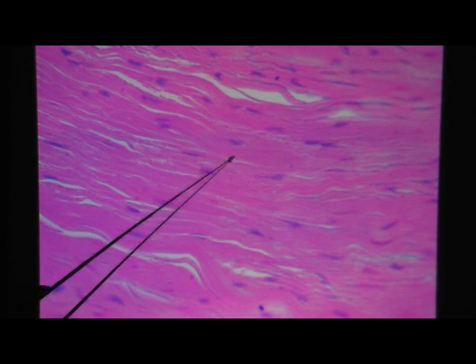Here it is again, wavy collagen fibers with fibroblast nuclei squeezed in between. Another look, collagen fibers are the pink stuff, and these would be the fibroblast nuclei.